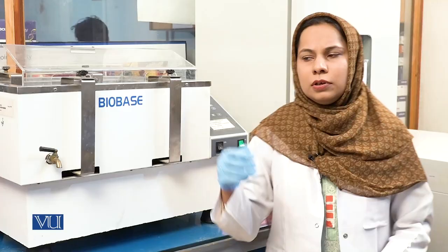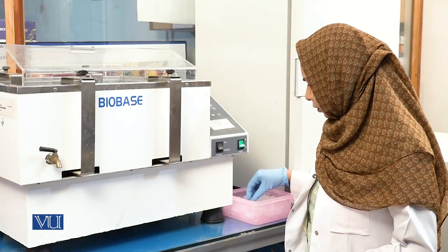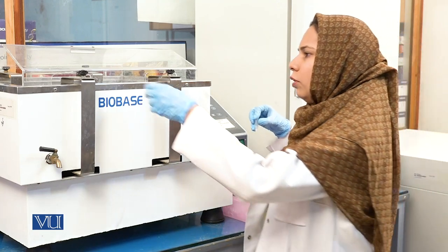Transformation of bacterial cells through the heat shock method is called heat shock because we give the transforming cells a shock of 42 degrees centigrade. For this we need a water bath. So after incubation of competent cells with the plasmid DNA, we will give a shock of about 1 minute, and we need to put the bacterial cells from ice into the water bath.